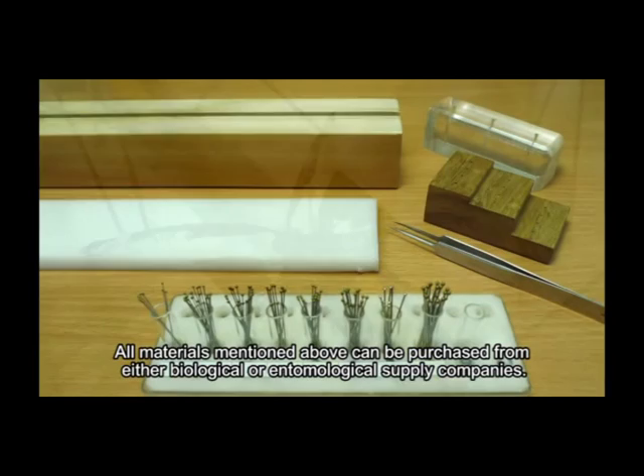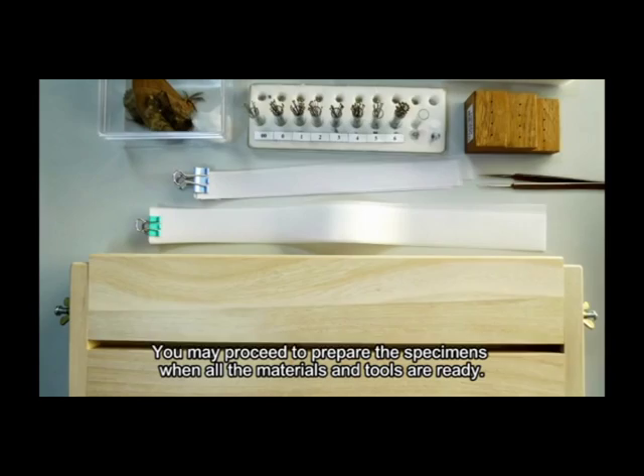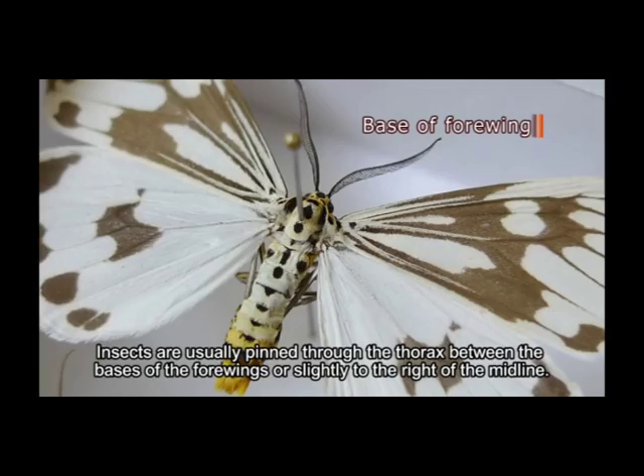Wing spreading boards are used for spreading the wings of butterfly and moth specimens so that wing characteristics are visible for study. All materials mentioned above can be purchased from either biological or entomological supply companies. You may proceed to prepare the specimens when all the materials and tools are ready.